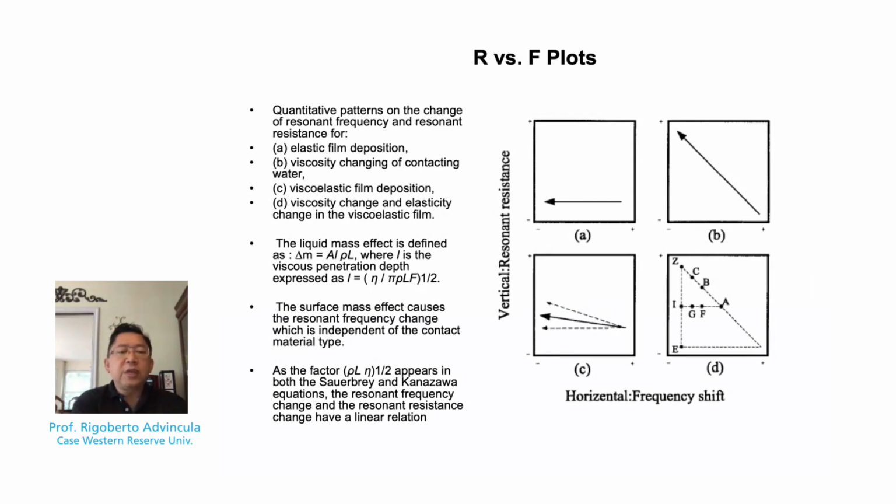The resonant frequency change, by the way, is independent of the contact material type, or in other words, this can be applied to almost any types of films from organic to metal. And what one simply monitors is the change in slope and any correction one does with the liquid media, and therefore applying the Kanazawa equation as well.